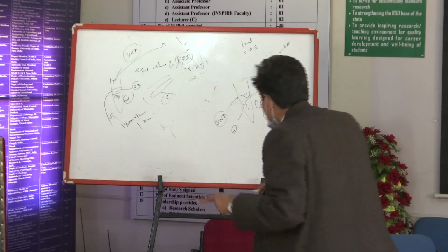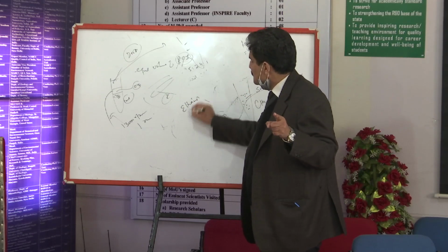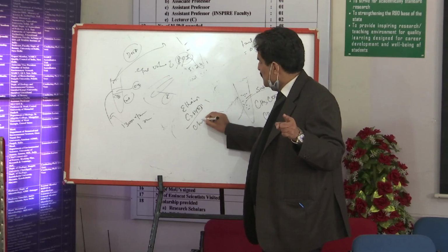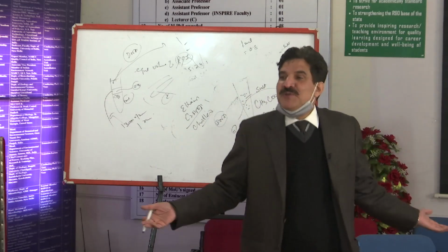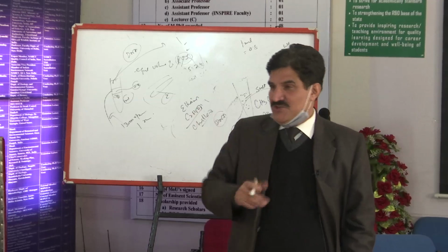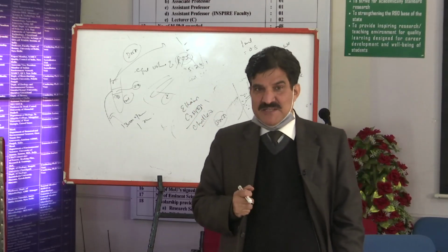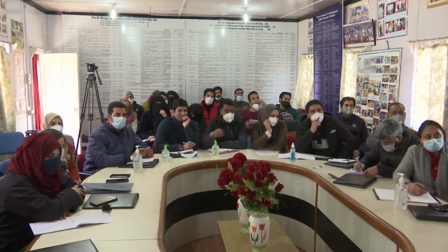So then we add ethanol, C2H5OH, but it should be chilled. Do you know why? Chilled means taken out of the deep freezer at minus 20, where it does not turn into ice and stays liquid, so we keep it in the deep freezer. So what will happen when you add ethanol? Ethanol has OH groups.